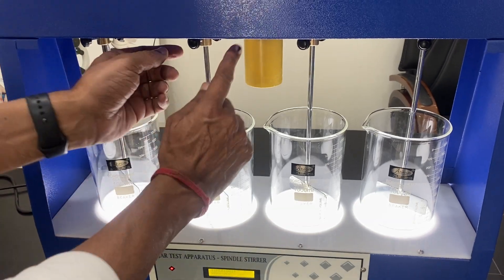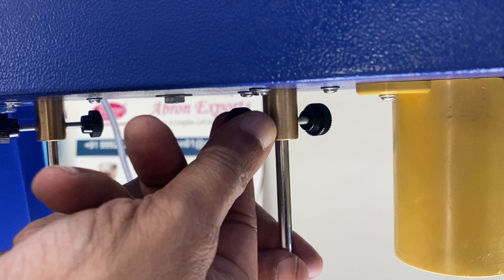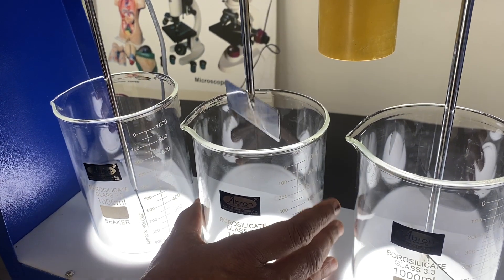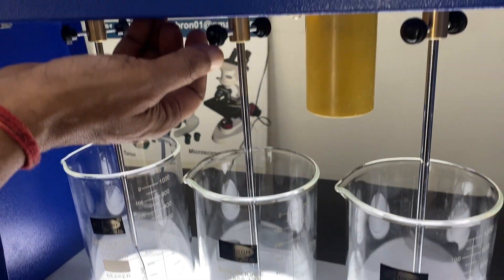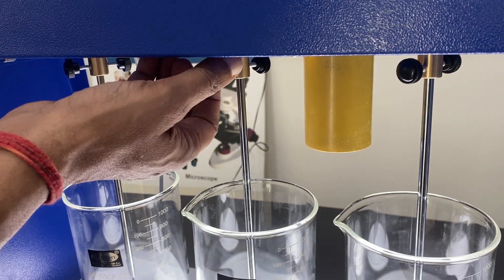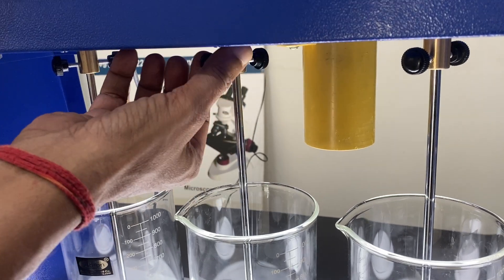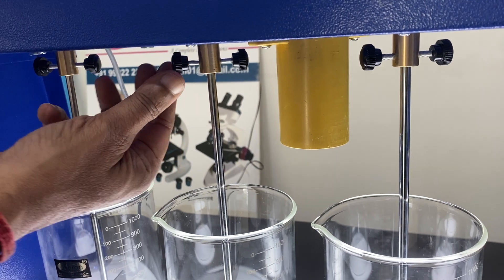Below there is one screw on both sides. You can open the screw and lift it up to take out the beaker. You can put it fully down or a little up as needed — just make sure both screws are tight. They go anti-clockwise.